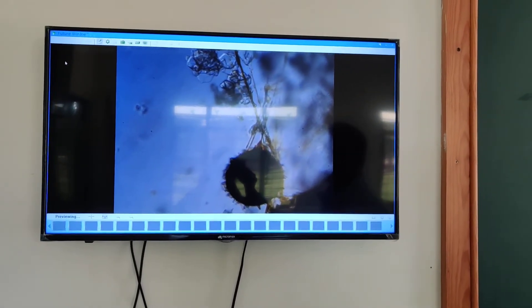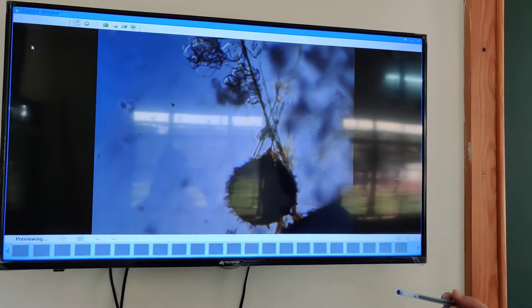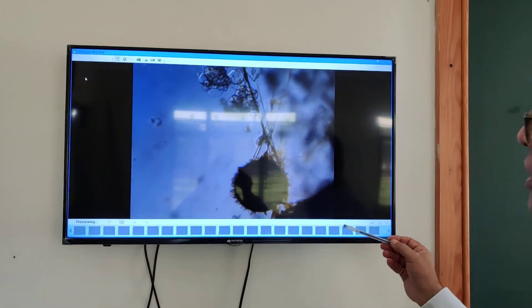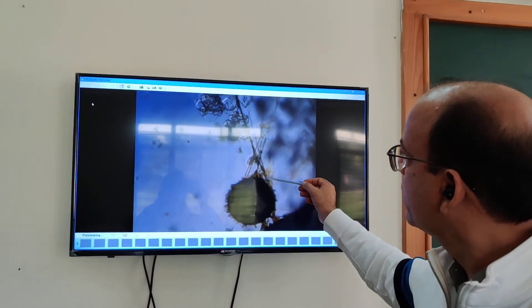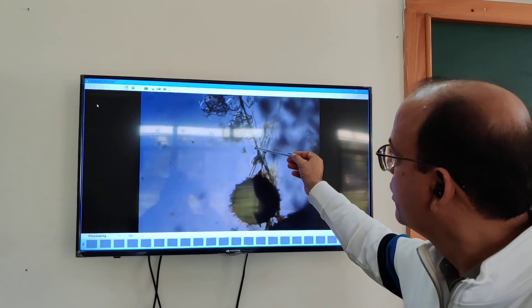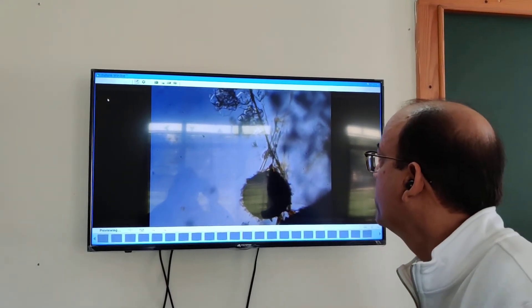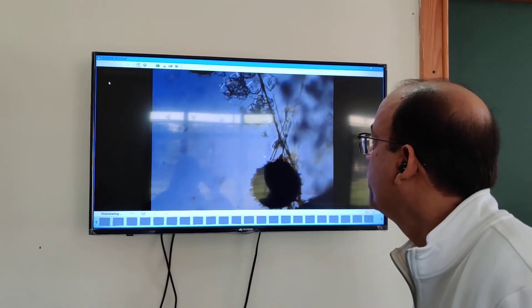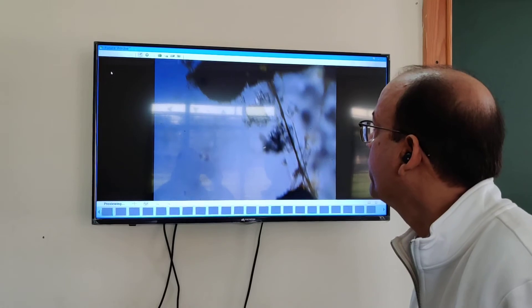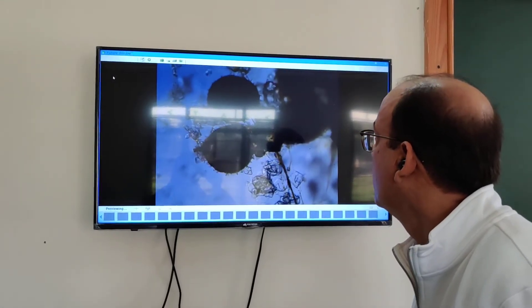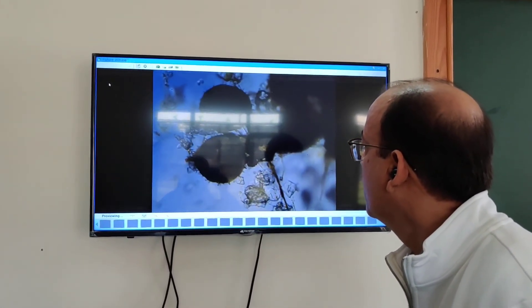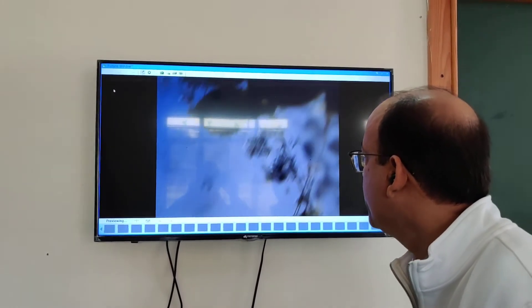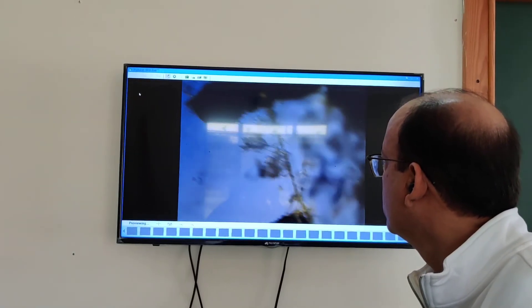In the next 5 minutes I am showing you some other pollen grain. In this pollen grain you can see this light colored tube is coming out. This is the pollen tube. You can see the other pollen grains also, and simultaneously we are counting how many pollen grains are showing germination.